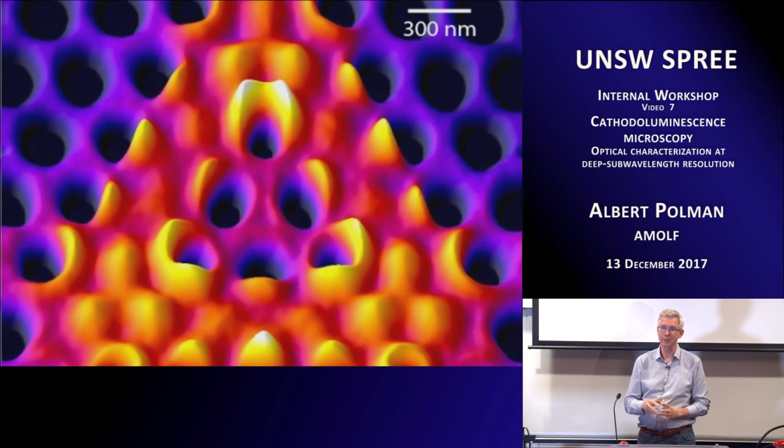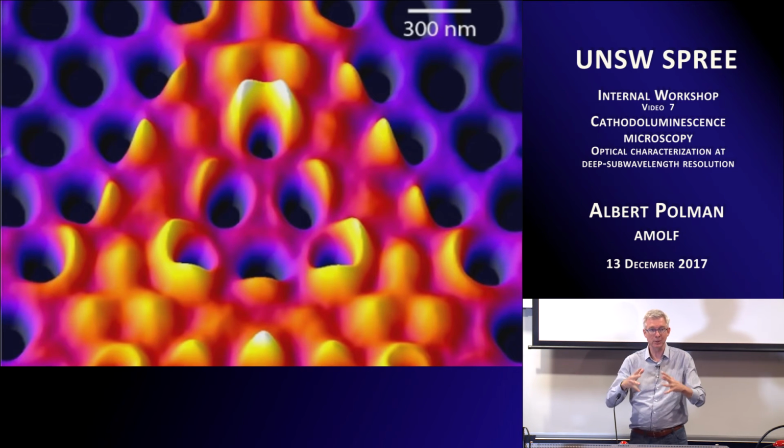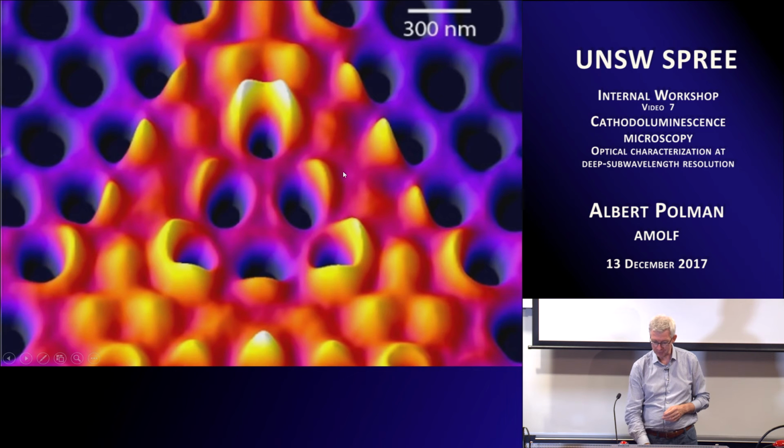Right? So you can see our electron microscope provides an image of how light is confined and stored inside this cavity. And look at the length scale again, 300 nanometer. If you see how sharp all these features are, you can really probe light at extremely high spatial resolution.